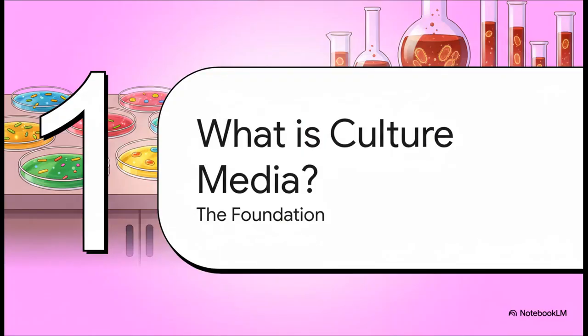So first up, what exactly is culture media? The easiest way to think about it is like the kitchen of the microbiology lab. It's basically a nutrient-packed recipe. Sometimes it looks like a soup, sometimes like a jelly, that lets us grow microorganisms like bacteria outside of their natural habitat so we can actually see them and study them.